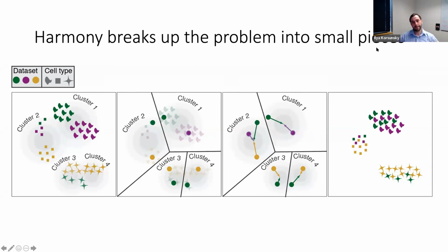Yes. And the next question from Jonah. Do you see problems integrating different data sets generated from different technologies? For example, single cell versus single nucleus sequencing, or even take one step further, single cell RNA sequencing versus another modality of spatial sequencing. I think there's tons of problems and everything, but the benefits outweigh the problems so much, right?